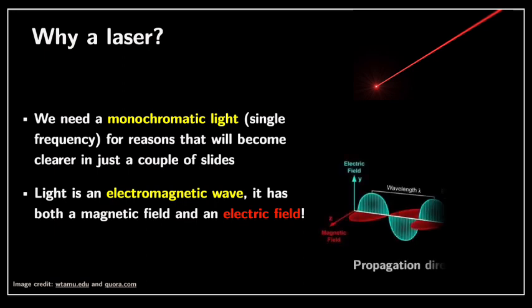So it's good to remember, for example, a plane wave here. If it goes in the direction k, which in this case is the x direction on this plot, we see that we have an oscillating magnetic field shown in red and an oscillating electric field shown in cyan color. This oscillating field is oscillating exactly at the frequency of the laser. So that's really what matters. We basically have a time-dependent electric field that is impinging on the material. And the question is, how does the material respond to this?